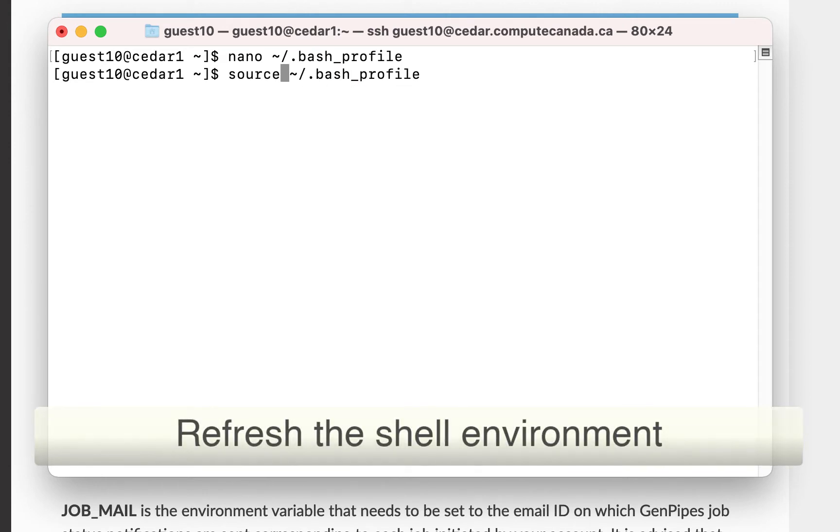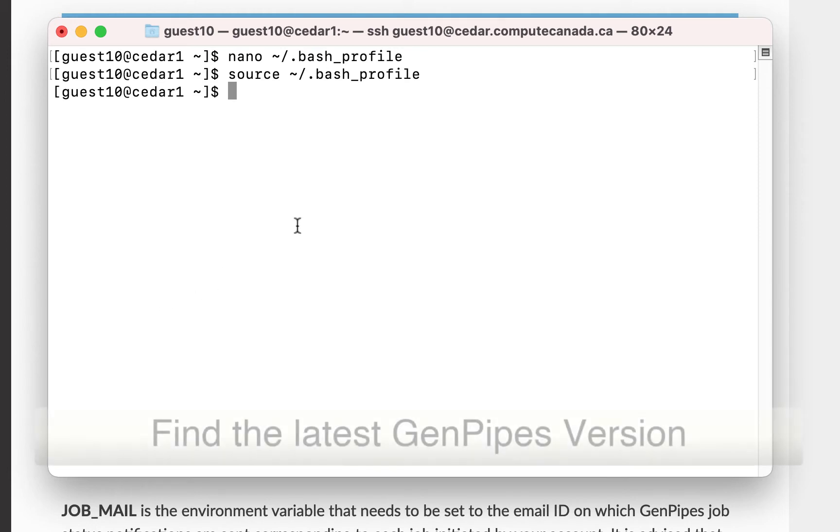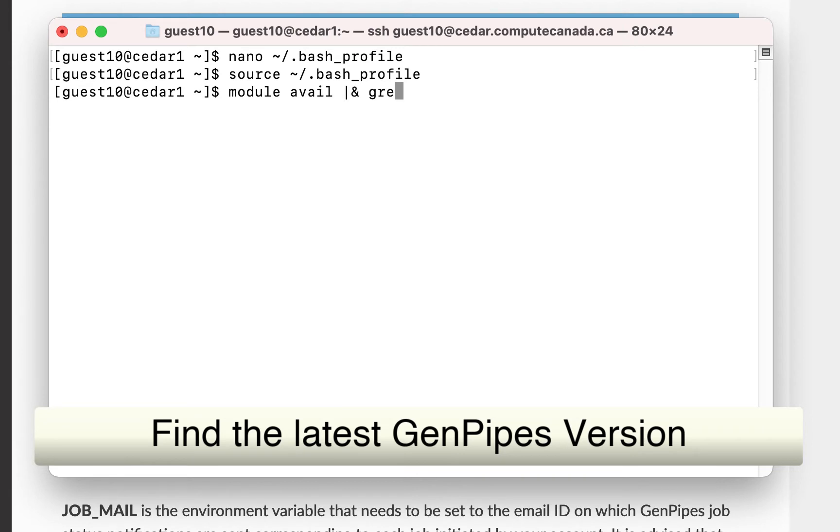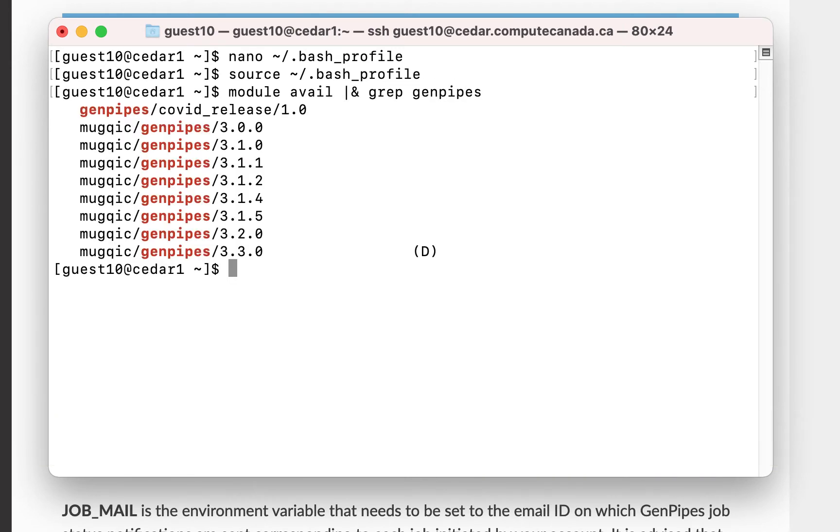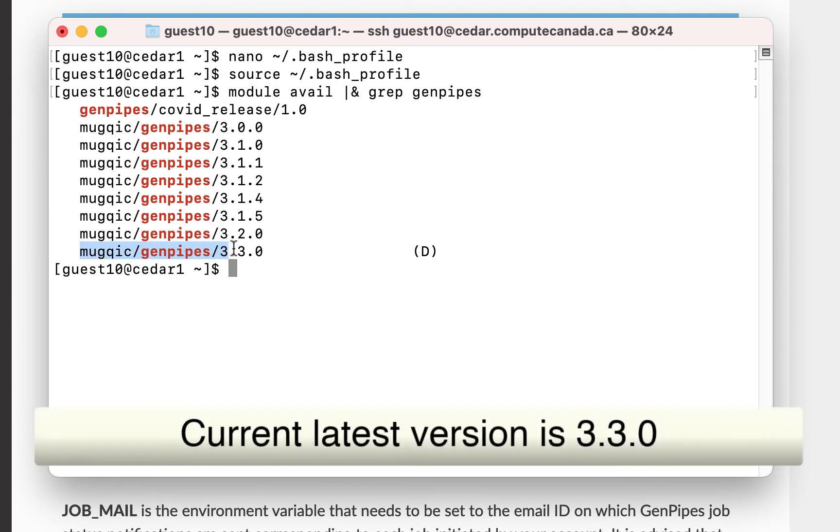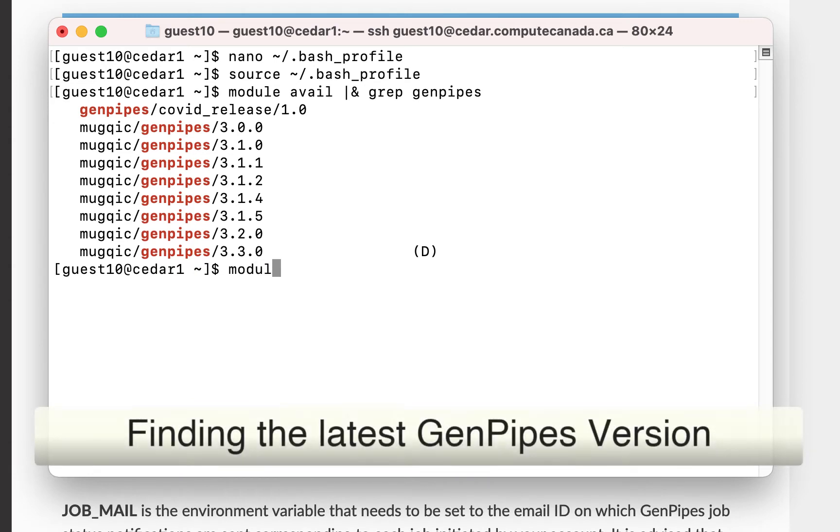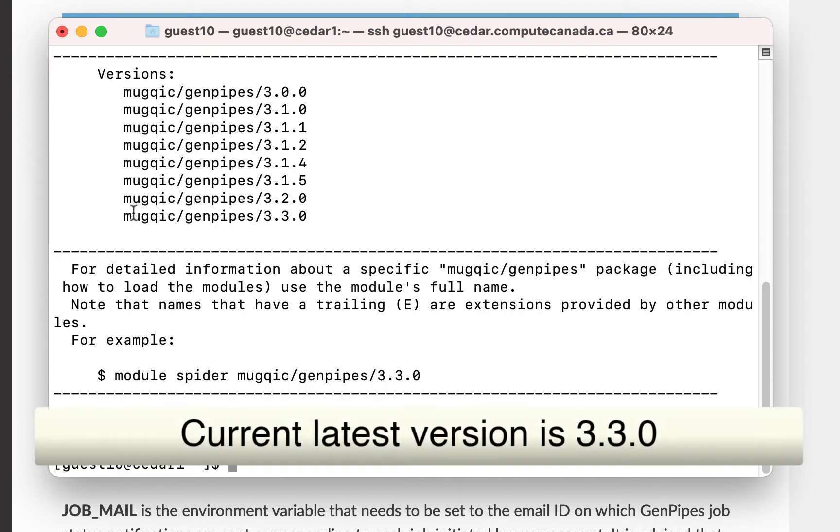Next you will need to find the latest version of GenPipes. You can find it by typing the code on the screen. This will show all of the available versions of GenPipes. You can also use the module spider to get this information. In this case the current version of GenPipes is 3.3.0.